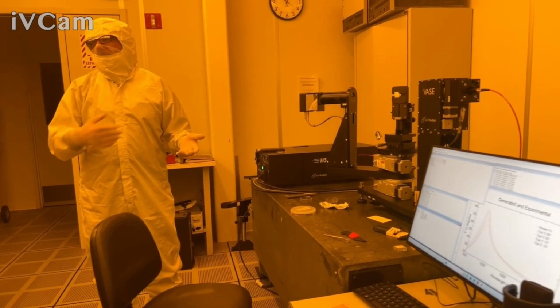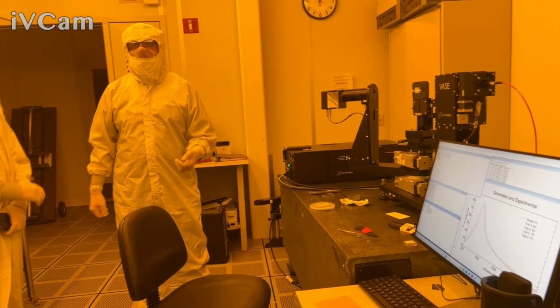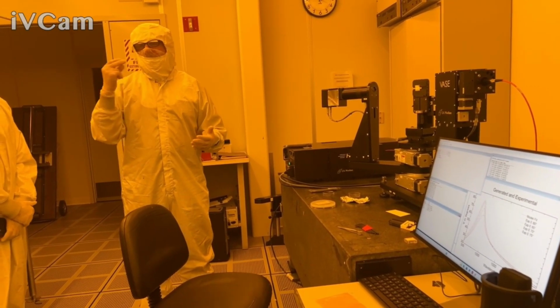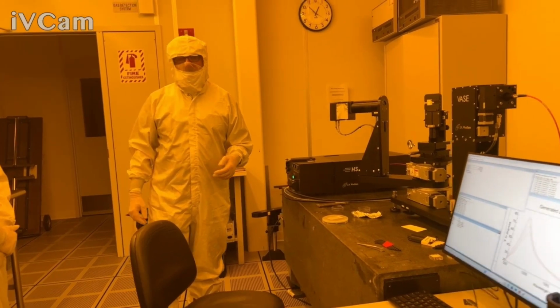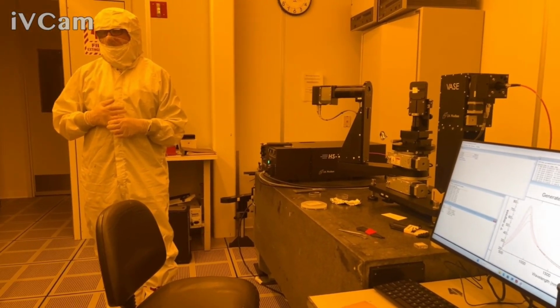There's an Isobar there that should protect from a standard surge, but you'd want to plug that in if you're constantly having those things. Of course. No, that'd be rare. We have it very rarely. Okay. Good.